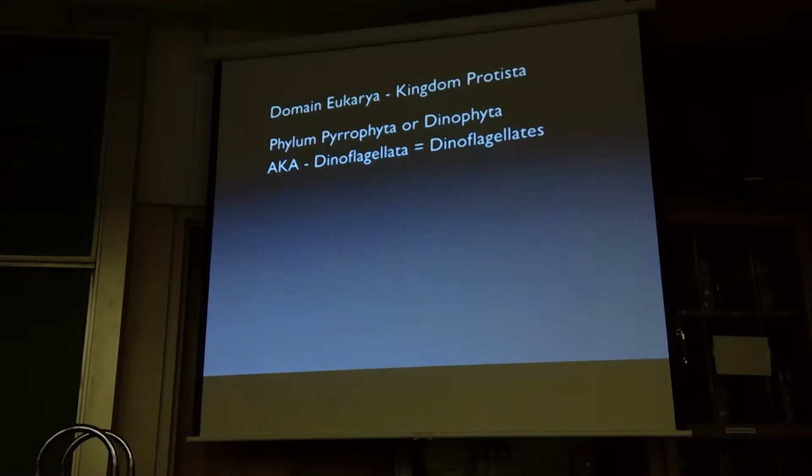But this little groove has a flagellum in it. And the flagellum that's in the groove, when it beats, it causes this thing to spin. So the term Dinoflagellata has to do with that spinning motion. Pyro refers to the red color. These guys cause red tides, so they have phycobilin proteins or phycobilin pigments, and the red refers to fire. Pyrophyta means they produce the red color. Dino has to do with spinning. Phyta, again, means they're an algae phylum.